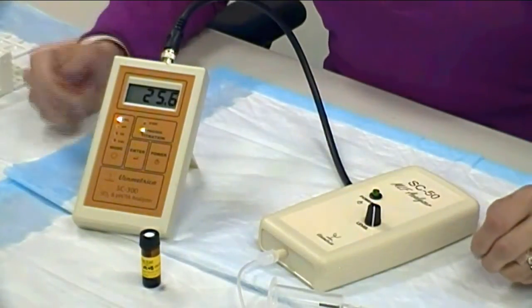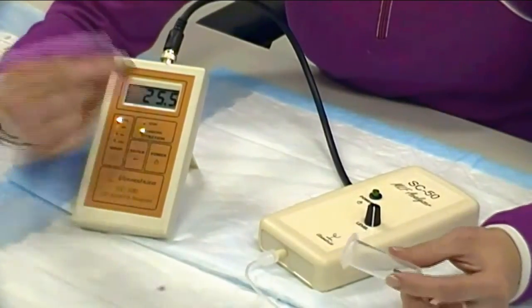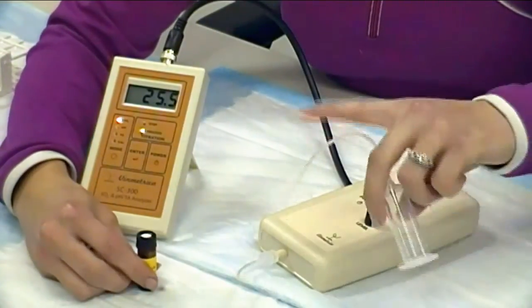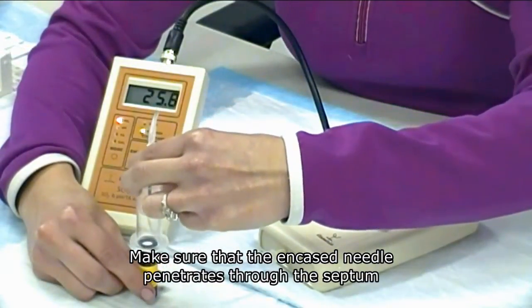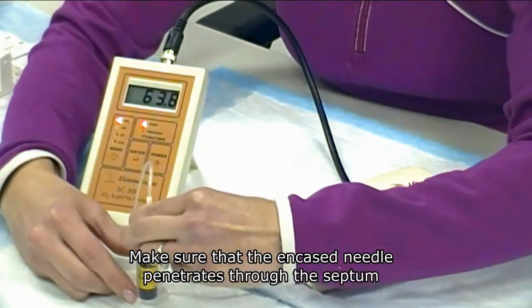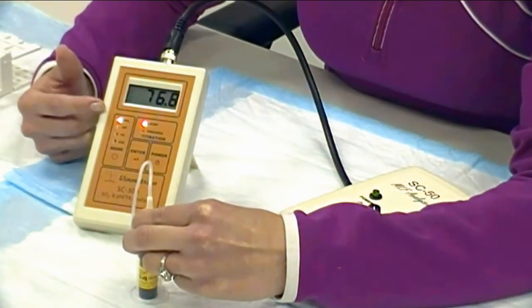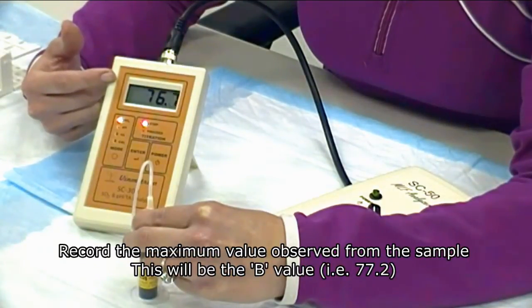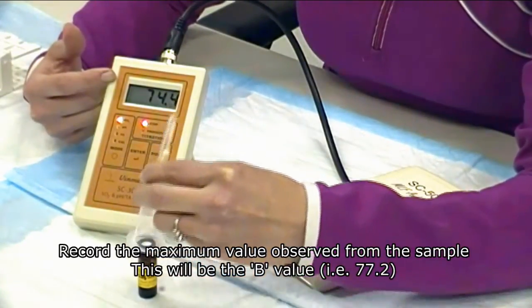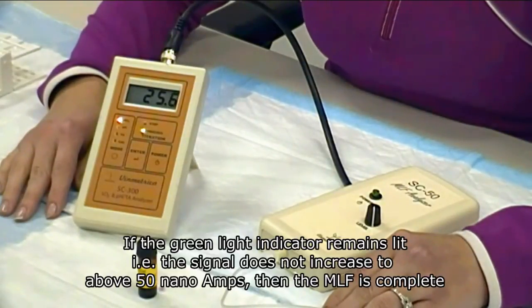We're now ready to take your first measurement. Gently shake your vial and make sure it is upright on your workstation. Hold the vial insertion assembly directly over your vial and depress down into the septum. The red stoplight indicates that MLF is not complete. If you wish to quantify your measurement, record the highest number shown on the SC300. To quantify your malic acid, follow the confirmation procedure.